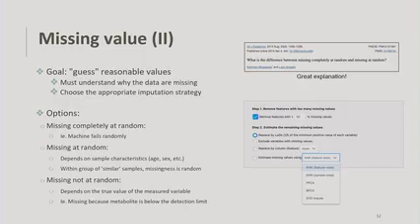It's exactly like it sounds. It's just like the machine randomly fails, and there's no pattern to why your data are missing. That's not usually the case for metabolomics data. The second is missing at random. So there's some randomness here, but it depends on sample characteristics. A usual example for this is given for clinical data that's collected at checkups.